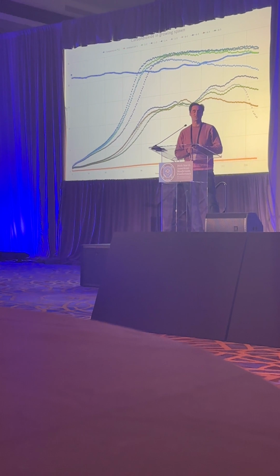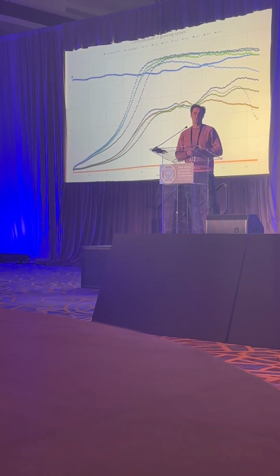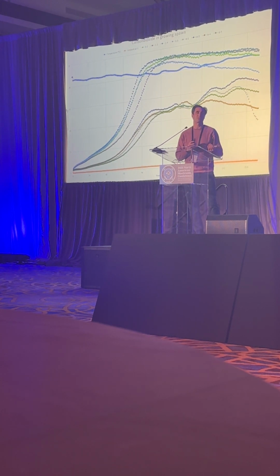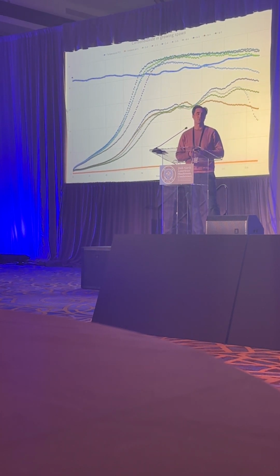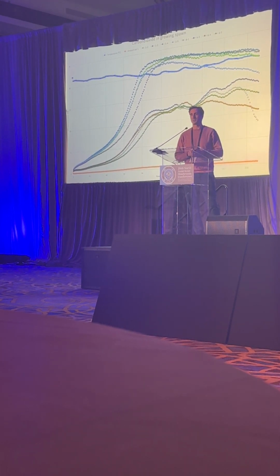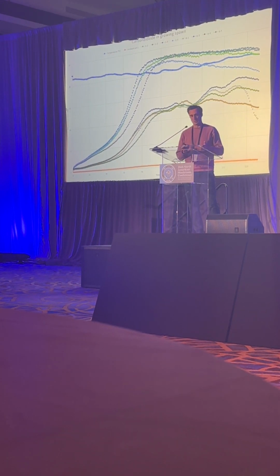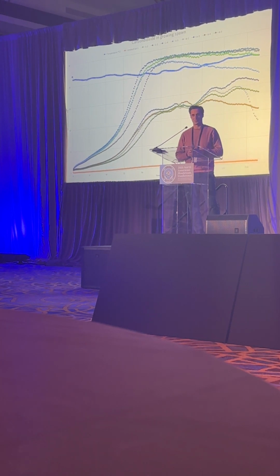Okay, so this is what's happening in the 6 filtered bags. Now, if we look at the 1 filtered bags, we don't really see the same phases. They are not as straightforward, but we do see that there's an increase in carbon dioxide straight away. That's because the bags just lack the filtration area to exchange the carbon dioxide to the outside. We also notice that they have the same tipping point at about 100 hours after inoculation, which is very interesting to me. We don't really know why yet. We have to do more research on that.